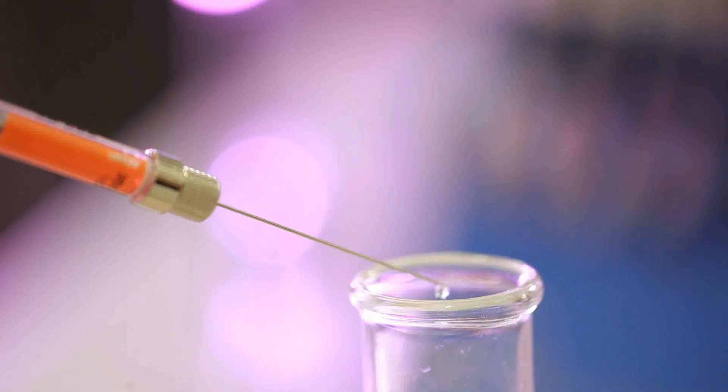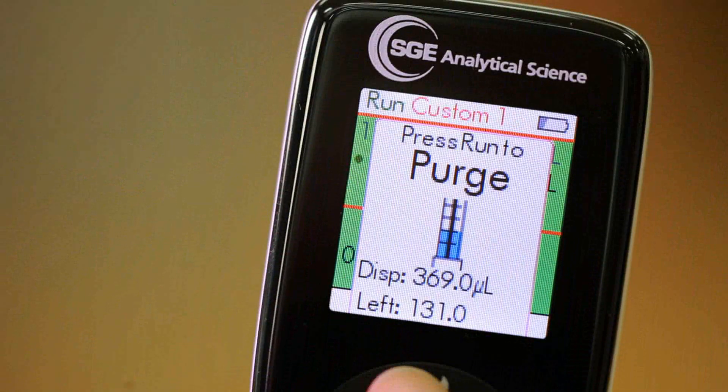And the drops can be stopped and the remaining volume in the syringe can be calculated automatically. Great for aspirating and dispensing unknown quantities of liquid.